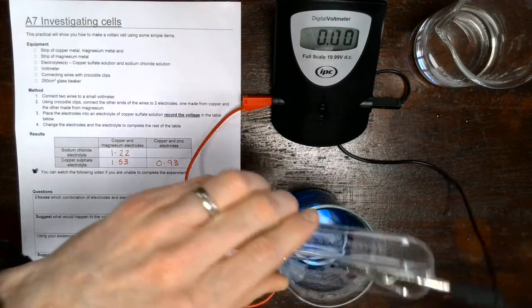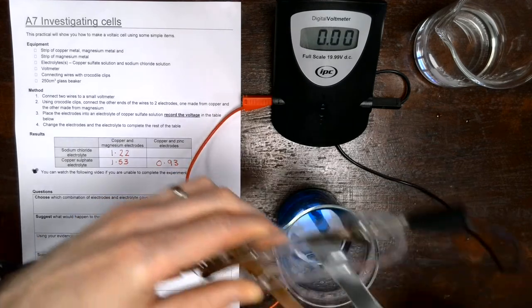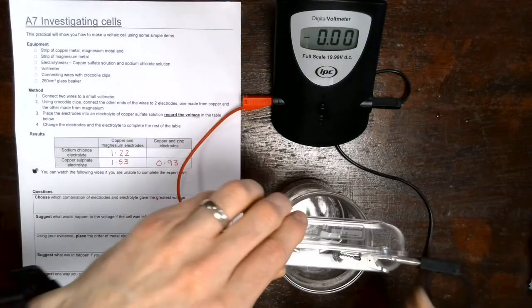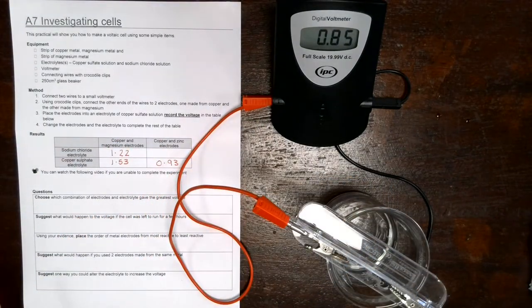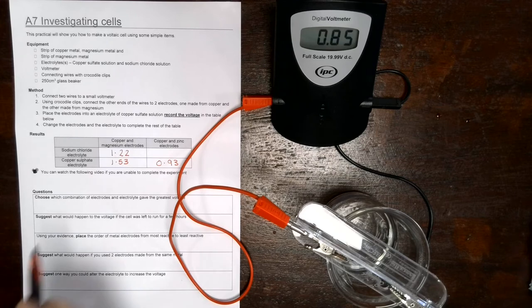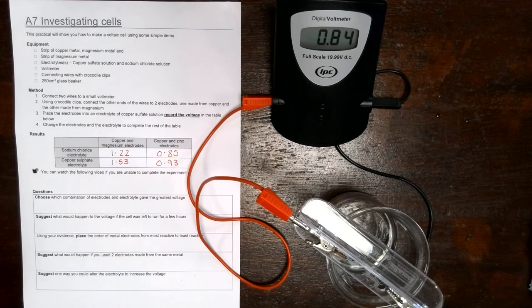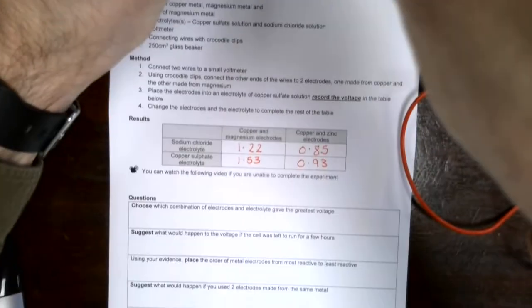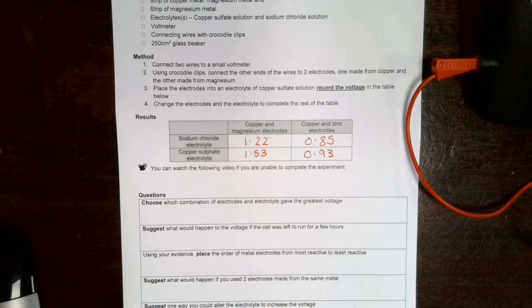Final one to do, so we've just now got to change over the electrolyte. Let's clean these up. We're going to take some sodium chloride solution, place it there, and now we get a value of 0.85. Okay, so I'll just move the camera in so you can get a close-up of the results. If you want to pause the video at this moment you can, so you can record the results, and you should now be able to complete the questions at the bottom of the page.